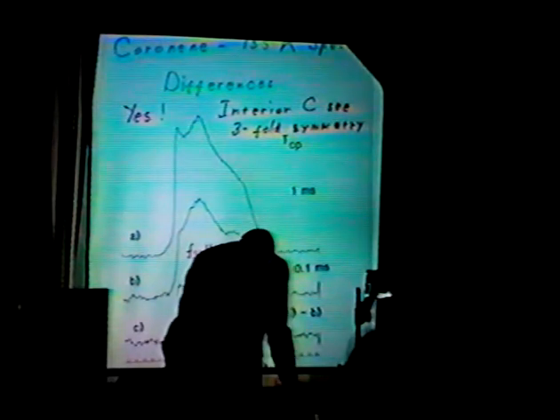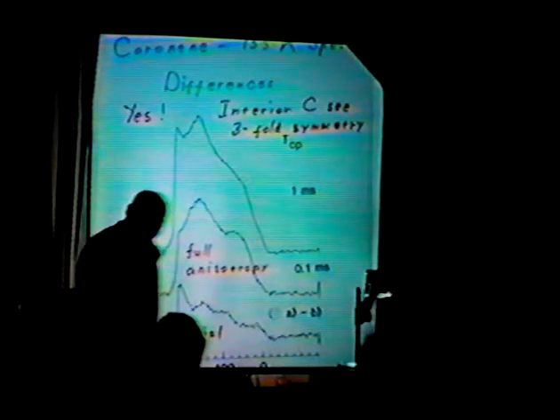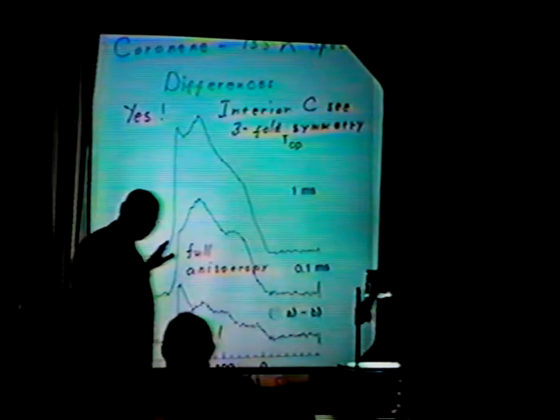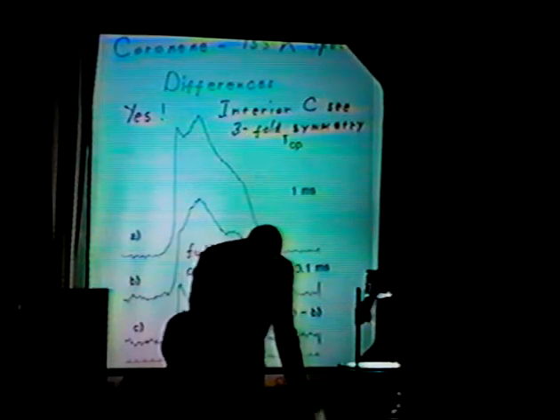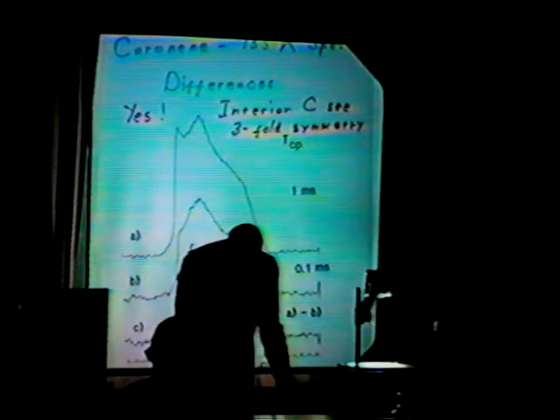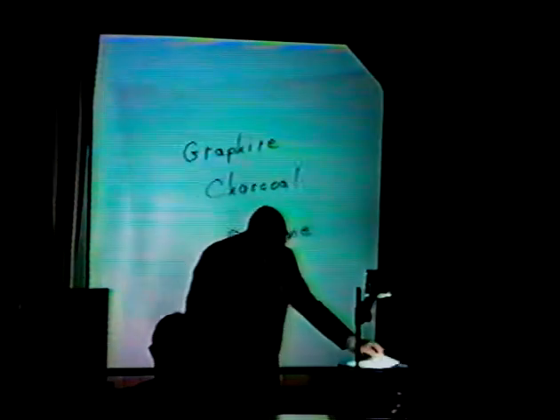So we've modeled charcoal with the small molecule coronene, and we've shown that the edge is about 2 atoms thick, and we should be able to use C13 NMR spectroscopy to measure the dimensions of ribbons in charcoal, and by extension, perhaps do the same thing for coking patterns.